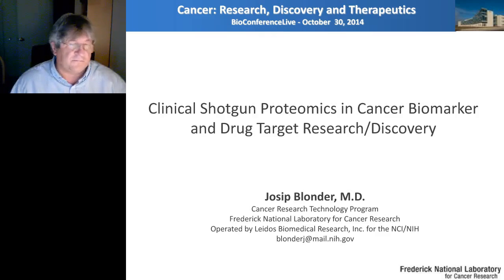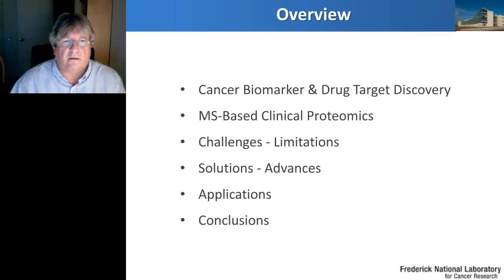My name is Josip and today I'm going to talk about clinical shotgun proteomics in cancer biomarker research and drug target research. I will be talking first about cancer biomarker and drug target discovery in general. Using MS-based clinical proteomics will be following. I'm going to discuss challenges, limitations, solution advances that we are trying to apply in our research, the application, and conclusions.